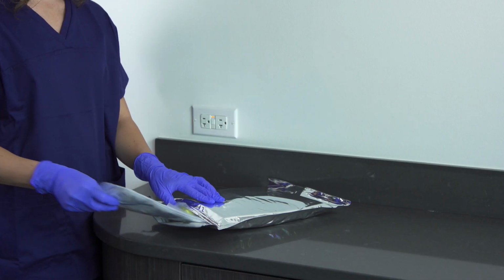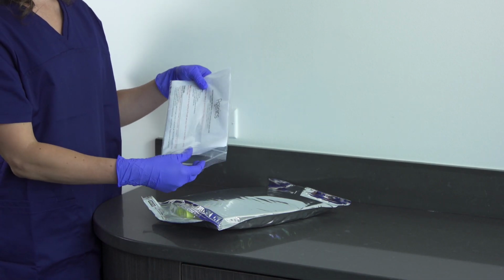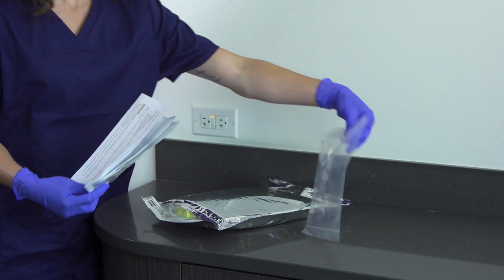You'll receive a water collection kit so they can sample their dental water and send it back to us on ice for analysis. Depending on the testing method the dentist chooses, they will receive their results within 2 to 7 days. Well, once a dentist receives their water collection kit, how would they sample the water to ensure accurate results?